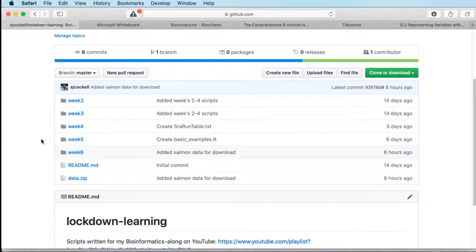So if at any point you have struggled to complete a bit, I know that there's some people who haven't necessarily had enough disk space for all the FastQ files, or who have had trouble downloading the data from the SRA, which is completely understandable, or any other stage, but you've carried on because you've wanted to continue with the lessons, which I entirely admire, then that data is available there so that you can pick up where we are now with the data that we're all working with, so everybody can have the same data representation in their R session.